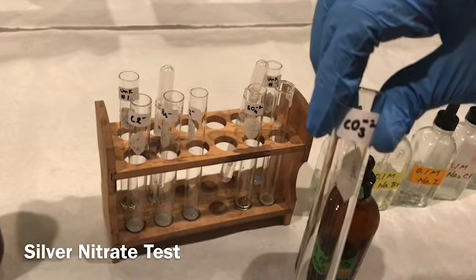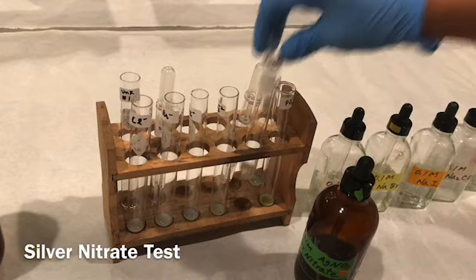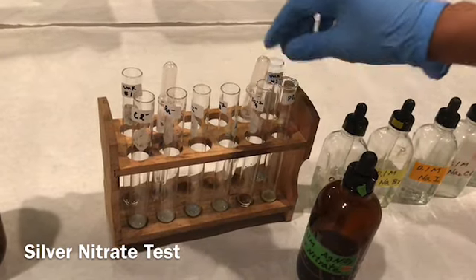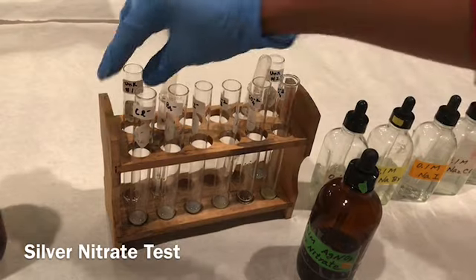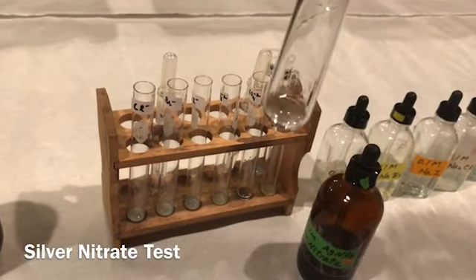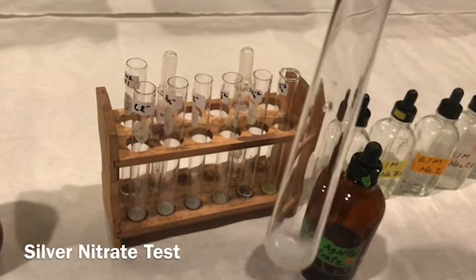Carbonate. Sulfate, phosphate. Okay, this is the unknown number 1, and this is the unknown number 2.